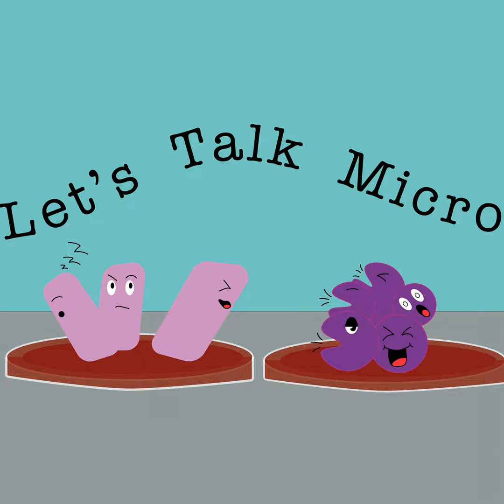So which gram-negative rods do we use this for? Well, of course, one of the most common groups that we use the indole for, the most common type of gram-negative rods, is the Enterobacteriaceae. And what are the Enterobacteriaceae? Well, this is a large group of gram-negative rods, and we're gonna get kinda technical. Some of its members are part of the human intestinal flora.